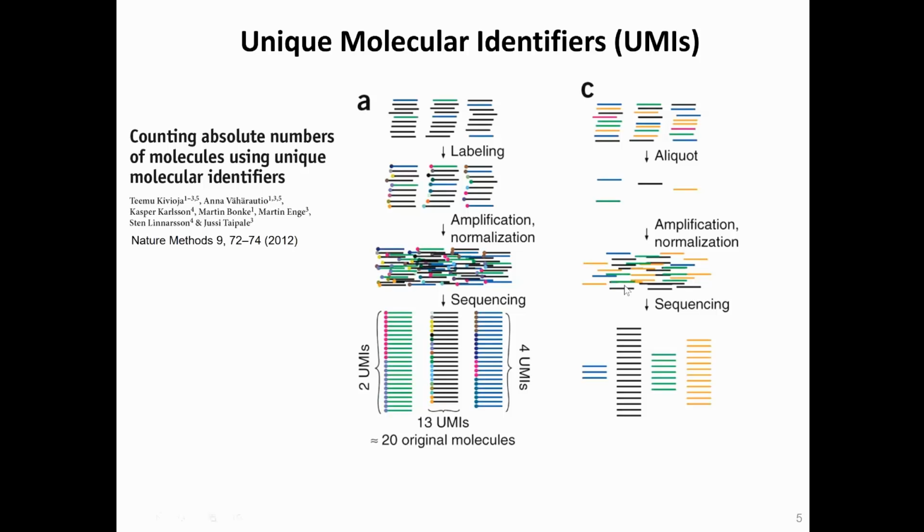But in terms of just getting actual counts, there's a big step between the final number of reads, the huge amount of things that happen, and the original aliquot. And you rely on all these steps in between not affecting the number of reads that you get.